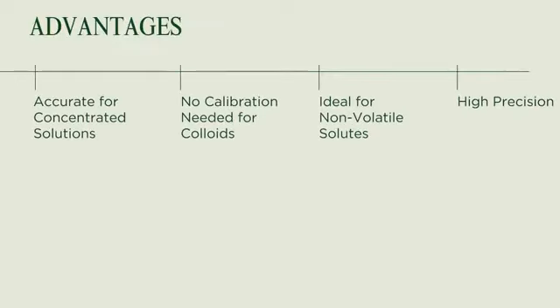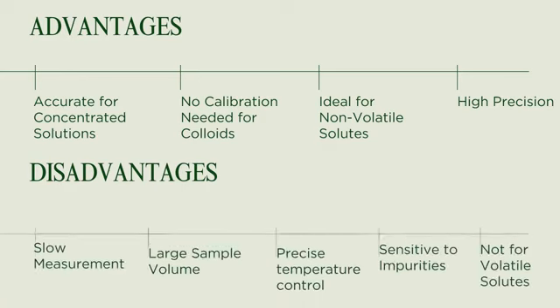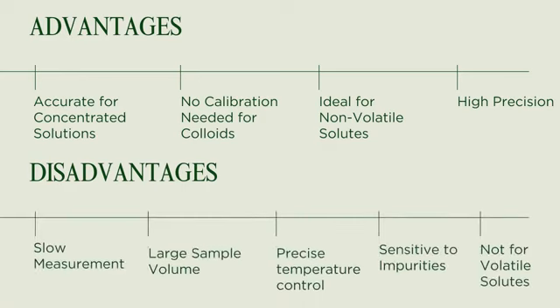Let's look at its advantages and disadvantages. Advantages are it is highly precise for concentrated solutions. It provides accurate measurements for solutions with high solute concentrations such as concentrated salts or other non-volatile solutes. There is no need for calibration curve for colloids. It is also reliable for non-volatile solutes. It provides high accuracy in determining osmotic properties for systems with high osmotic pressures.